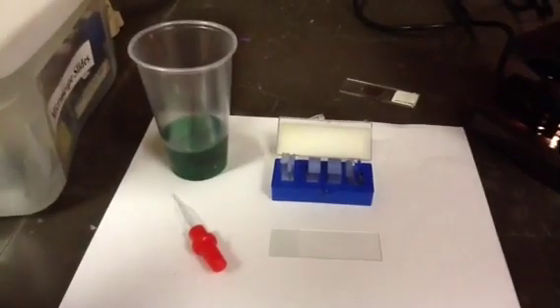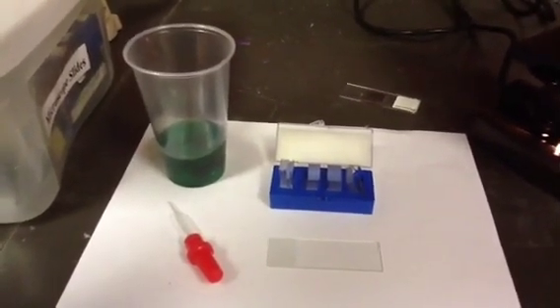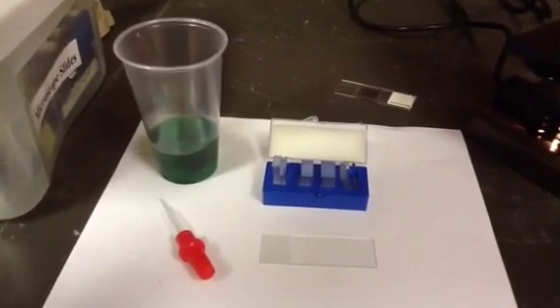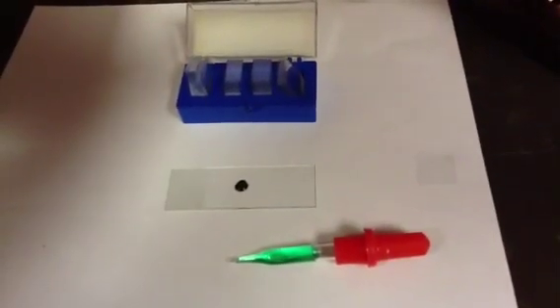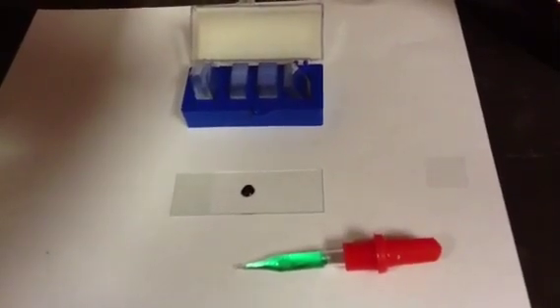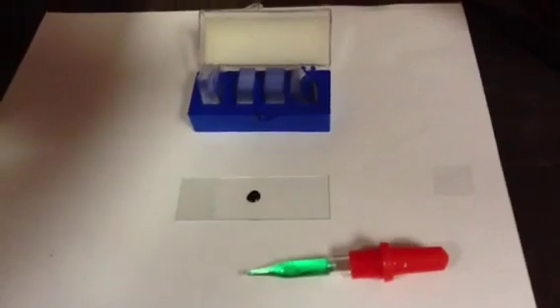A wet mount slide is slightly different because you're dealing with liquids. You'll need to use a dropper and whatever liquid it is that you're taking a sample of. You'll put a single drop of your sample onto your slide. When making a wet mount, you're going to be dealing with liquids. You're going to place one drop of your sample onto your slide. Then you're going to cover it with a cover slip.